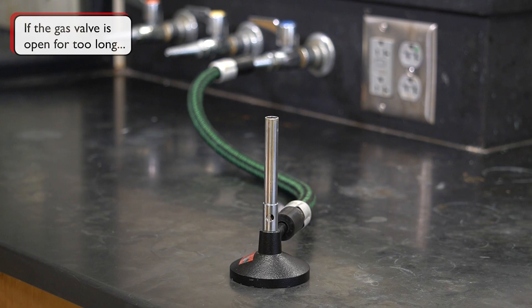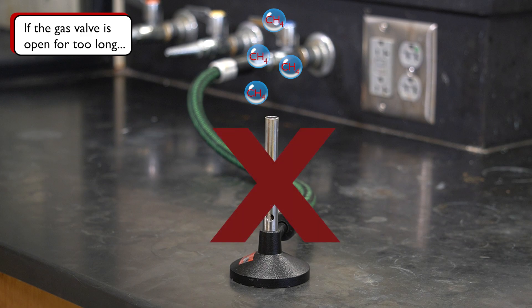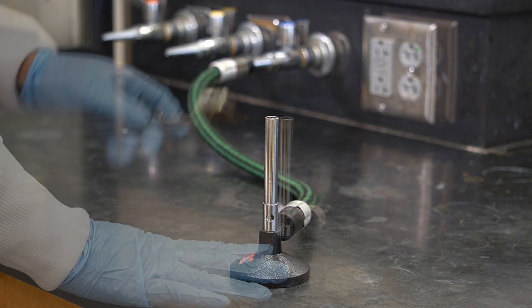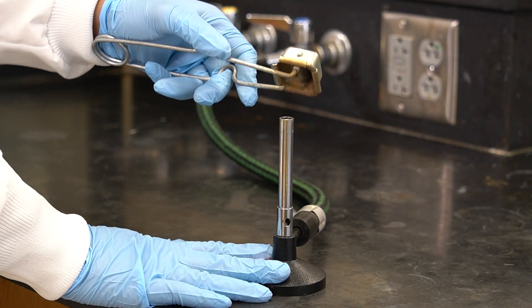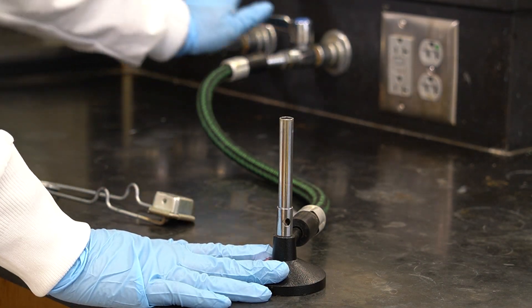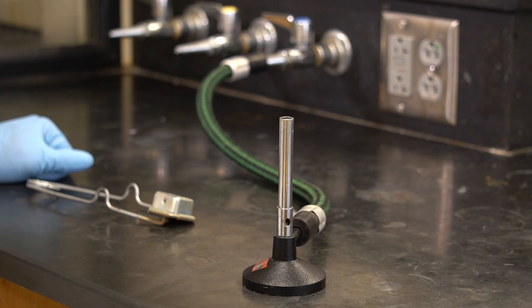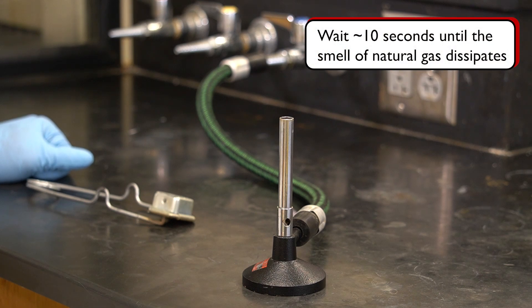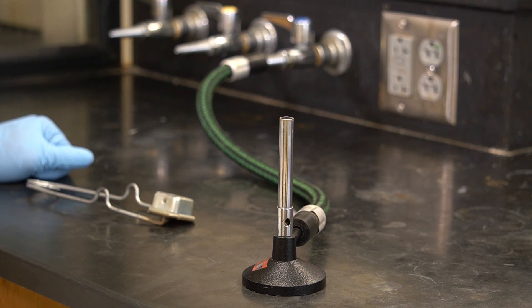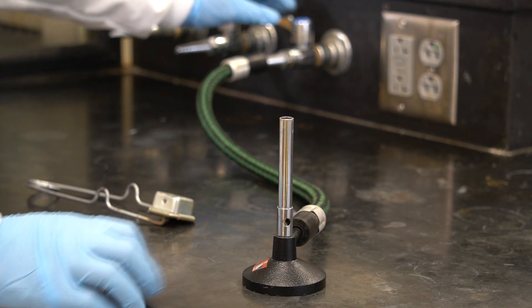It is very important that we do not leave the natural gas flowing for too long without a flame. We do not want to cause a natural gas leak in the building. If you are unable to spark a flame after a few tries, turn off the natural gas nozzle and wait a few seconds until the smell of natural gas dissipates. Now, adjust our burner and try again.